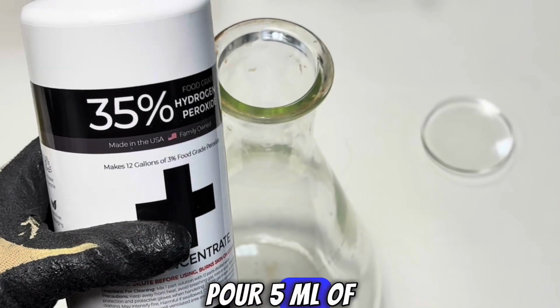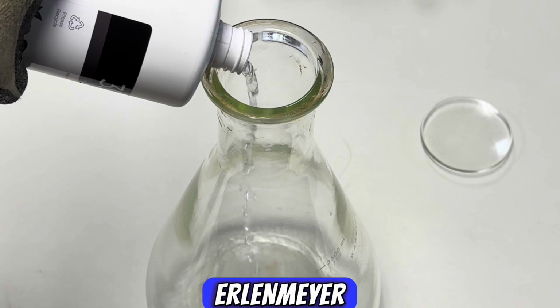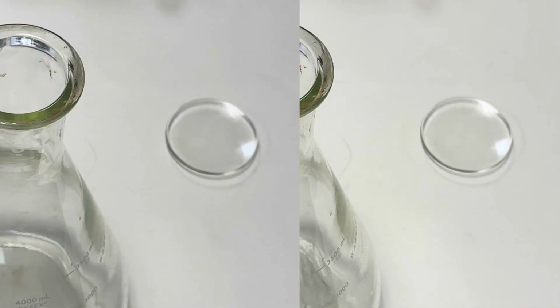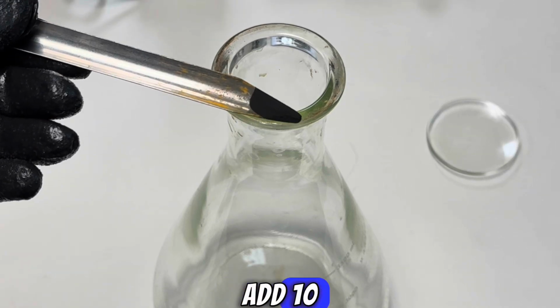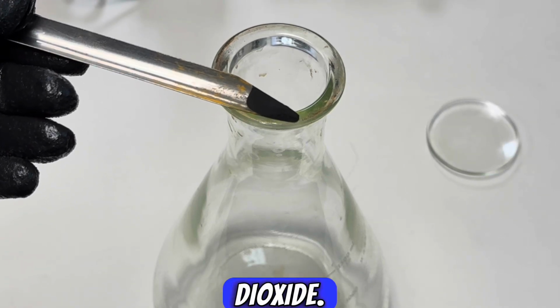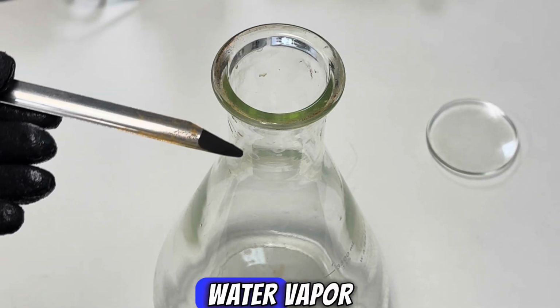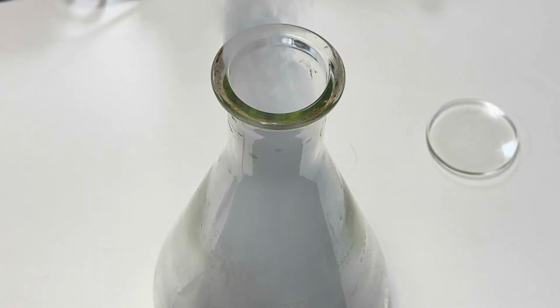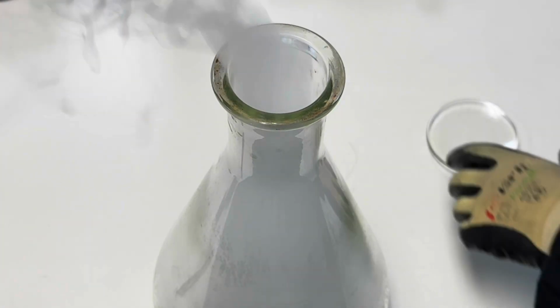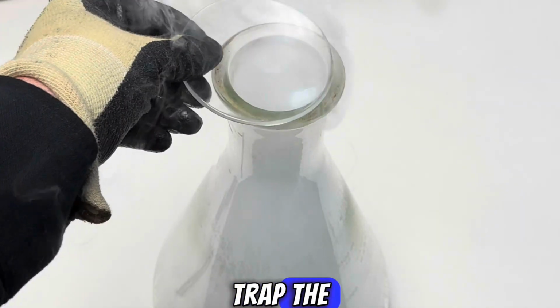Next, pour 5 milliliters of 35% hydrogen peroxide into your 4,000 milliliter Erlenmeyer flask. To catalyze the decomposition of your hydrogen peroxide, add 10 milligrams of manganese dioxide. This will serve as the catalyst and release oxygen and water vapor from your hydrogen peroxide. Place a watch glass over the mouth of your Erlenmeyer flask to trap the oxygen.